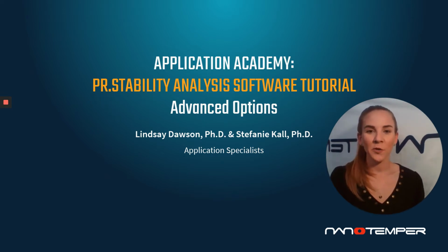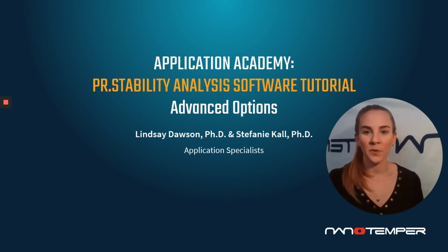In this tutorial, we're going to touch on some of the more advanced options built into our PR.Stability Analysis software. Now, this software has so many capabilities built into it that we really thought it would be best to dedicate a single tutorial just to showing you how you can optimally view and analyze your data sets.